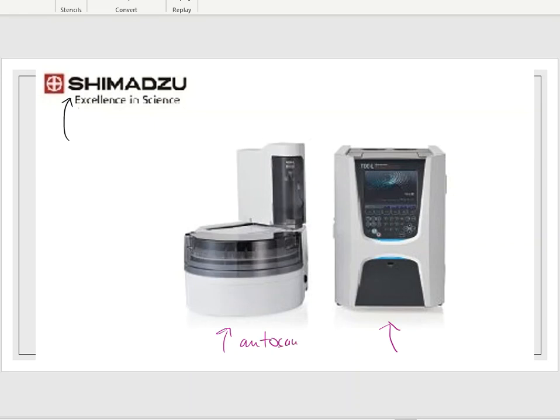All right. The auto sampler I'll talk about in more detail in just a minute, but it allows me as an analyst to load up multiple samples at one time, and that way the auto sampler can inject those samples one by one, and I can really just walk off and leave this instrument and let it do its own thing. And then hours and hours later, I could come back, and then all of the samples will be analyzed, and I will have data for all of them on my computer screen.